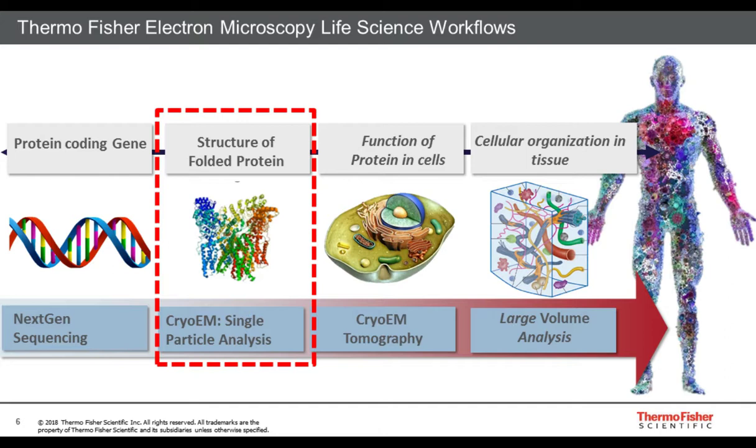It is obviously very important that the information that is revealed by performing crystallography and Cryo-EM single particle analysis is translated into the cellular context. Obviously, it's interesting to look at one individual protein complex, but it's only functional when you look at it in the context of the cell. And that is where Cryo-EM tomography will kick in: the transposition of high molecular structure biology information obtained by SPA and crystallography into the cellular context. And ultimately, the same story is true, it fits into a cell, into a tissue, into an organ, and into the total body.